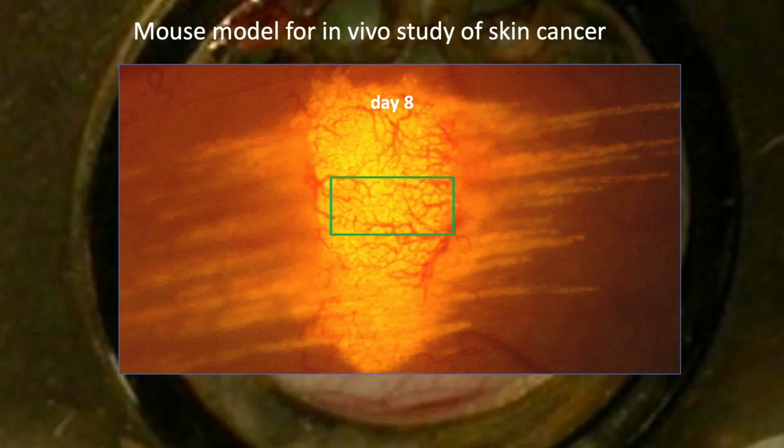So in this image, you can see the nuclei of HT1080 double color fibrosarcoma cells that are invading collectively into the mouse dermis. As you can see, they are following the path of least resistance, which is the interstitial space within the myofibers, so they're following the natural tissue tracks.